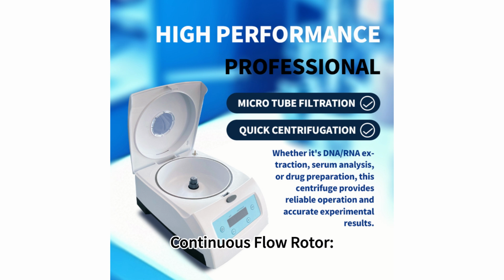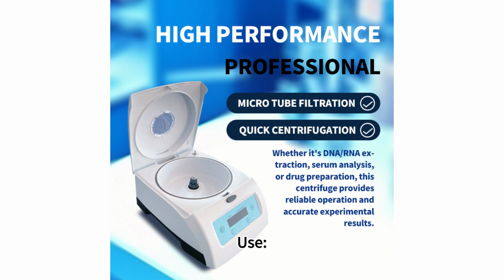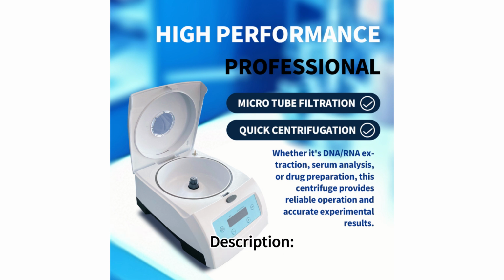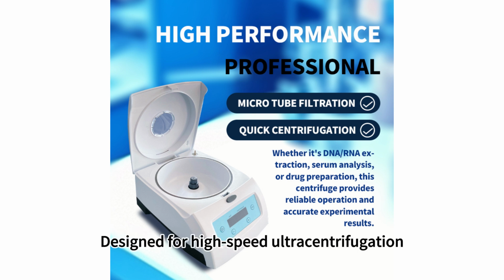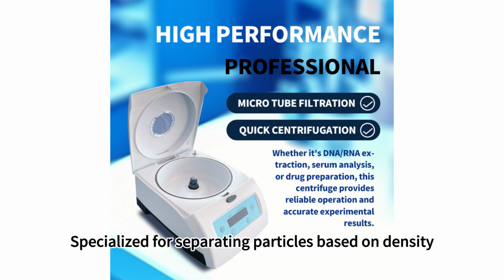Continuous flow rotor. Description: samples flow continuously into the rotor during operation. Use for high-throughput processing and continuous separation. Zonal rotor. Description: designed for high-speed ultracentrifugation. Use specialized for separating particles based on density.